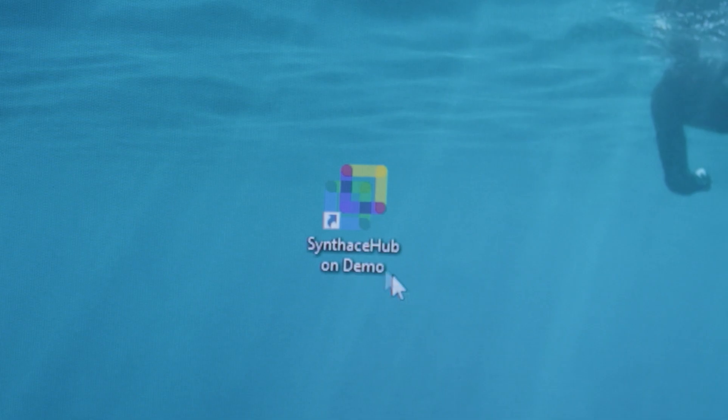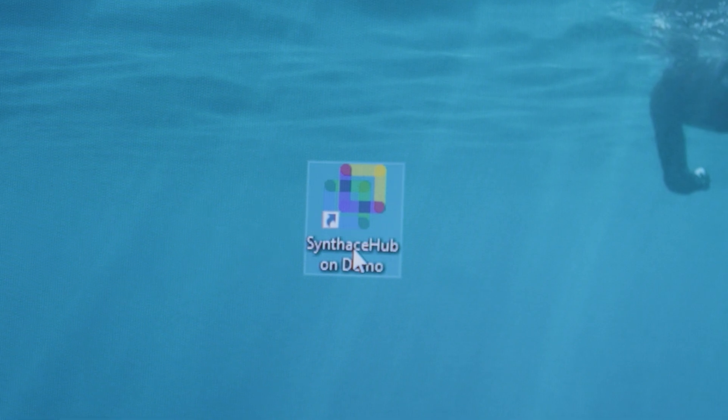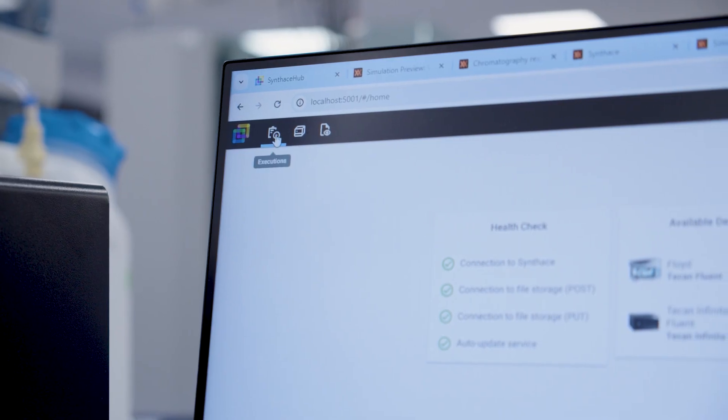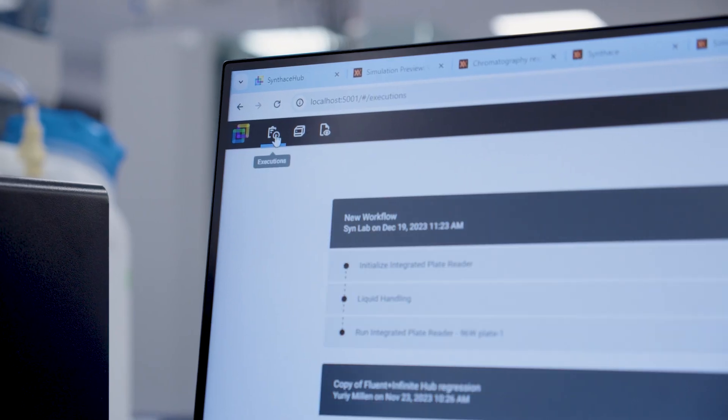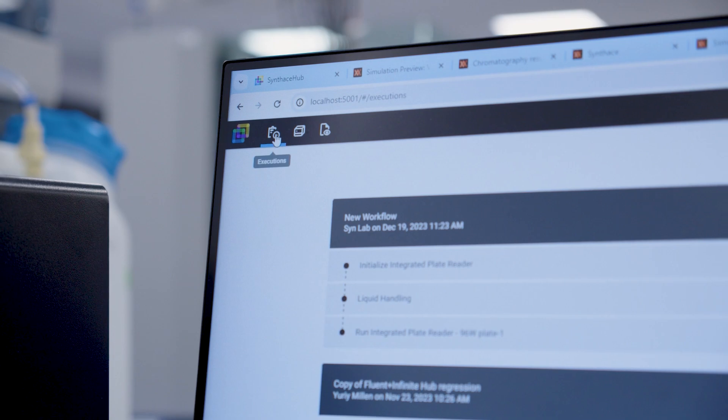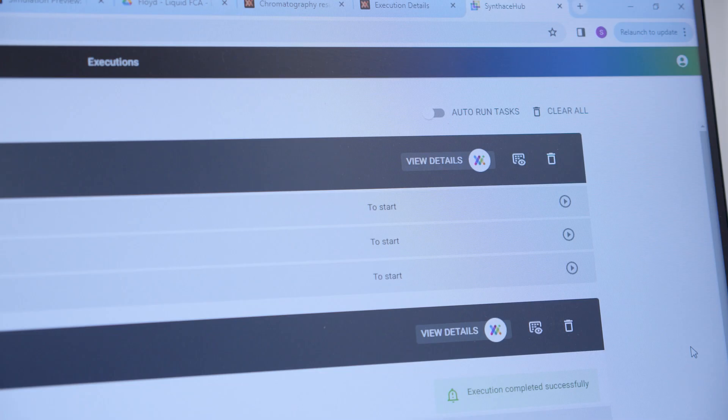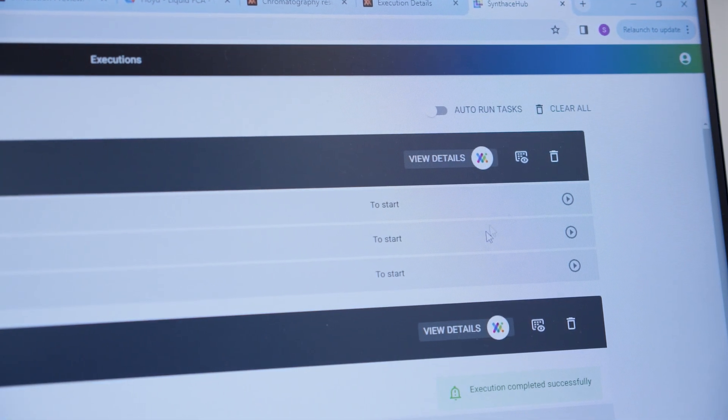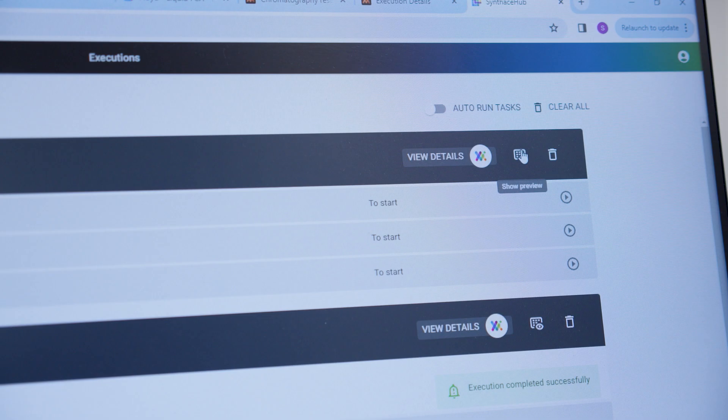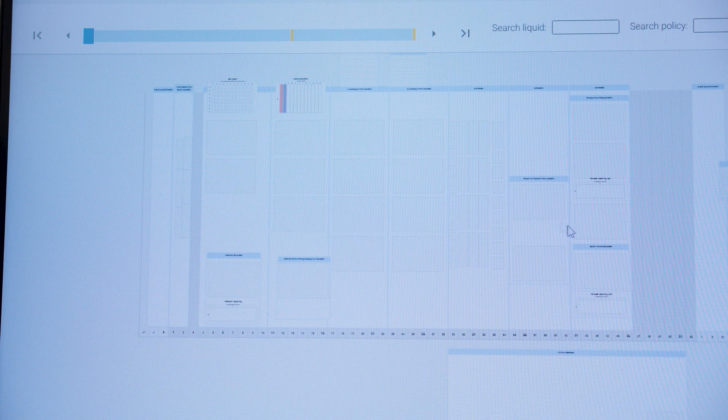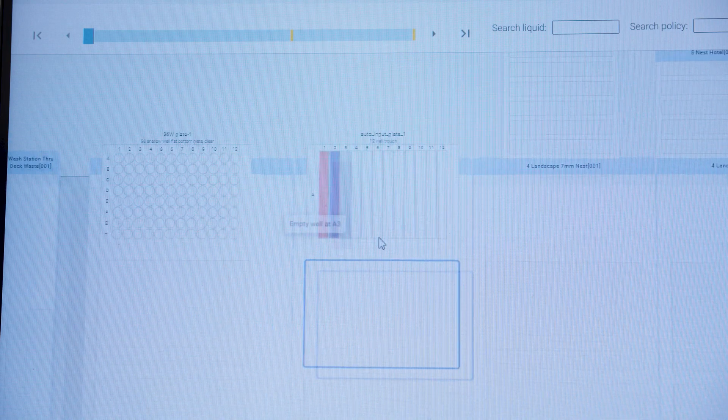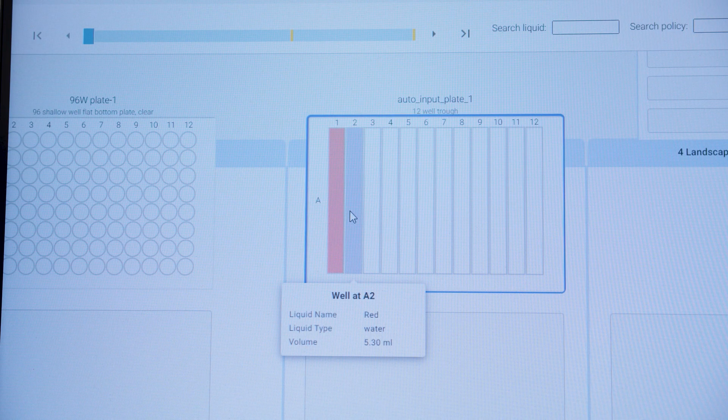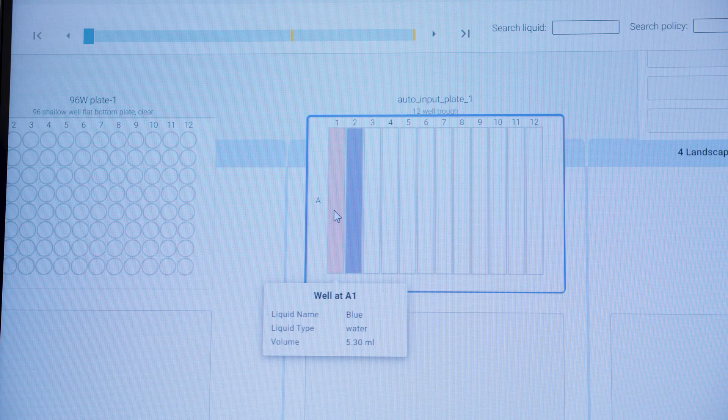So open up Synthase Hub and navigate to the Executions tab and you'll see your execution there. Before we start the run we'll need to set up the Fluent deck. To do this click show preview on the Synthase Hub execution and we'll simply need to set up the Fluent to match this.